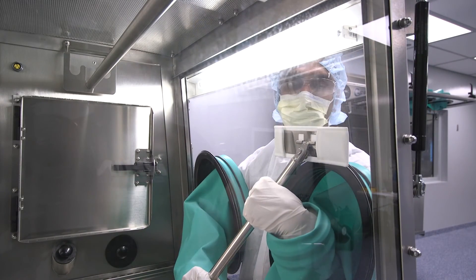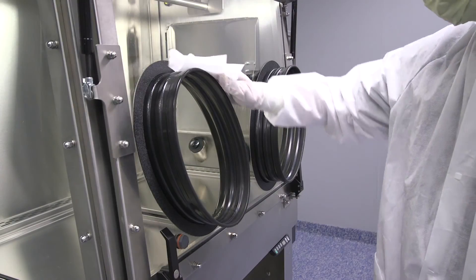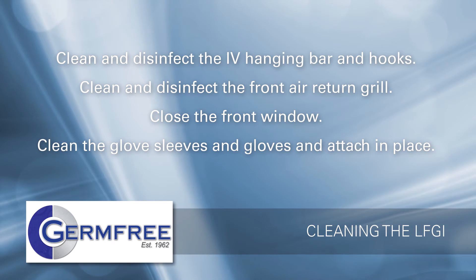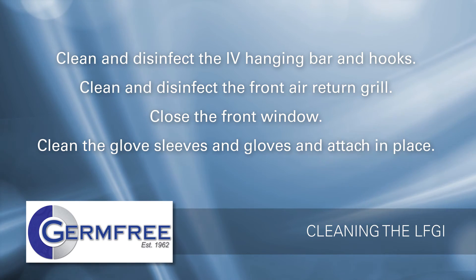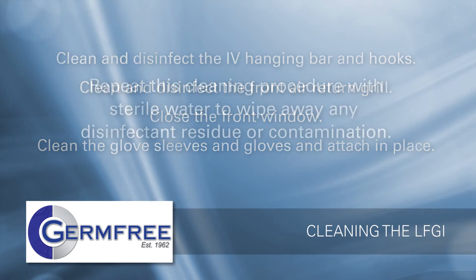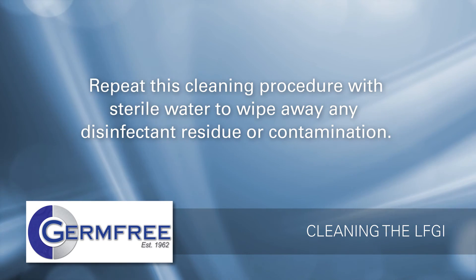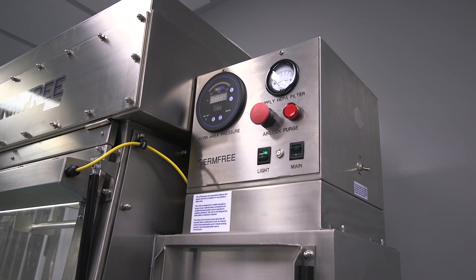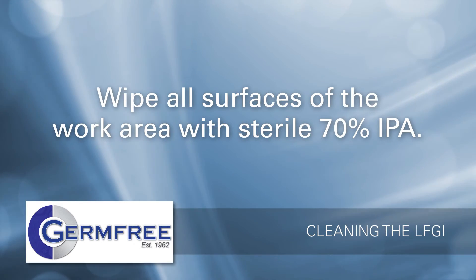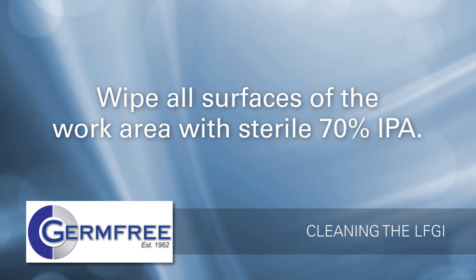Clean the inside of the window and the window frame. Clean the open front access window from top to bottom. Use a disinfectant wipe to clean the glove ports. Clean and disinfect the IV hanging bar and hooks, and the front air return grill. Close the front window. Clean the glove sleeves and gloves and replace them on the front window. Without removing the sleeves and gloves, repeat the cleaning procedure with sterile water to wipe away any disinfectant residue or contamination.